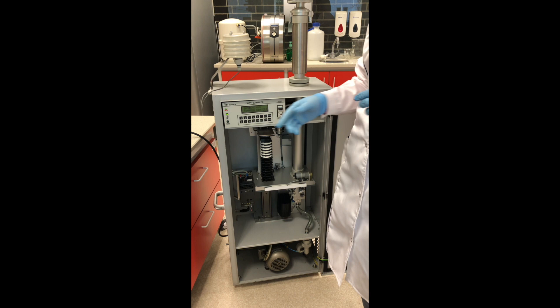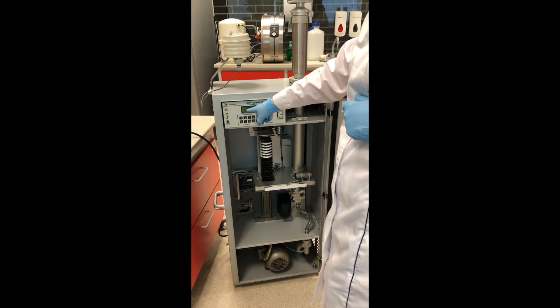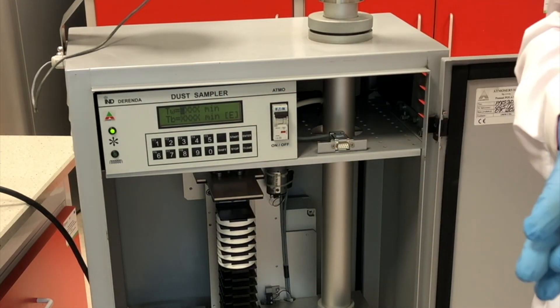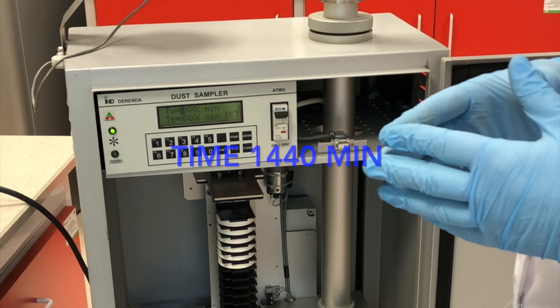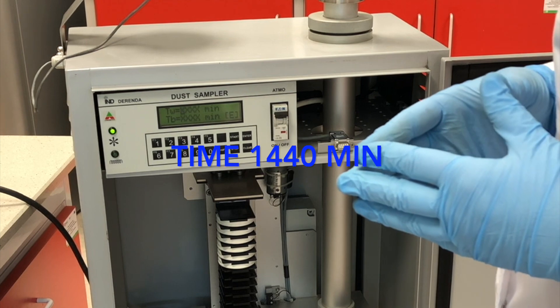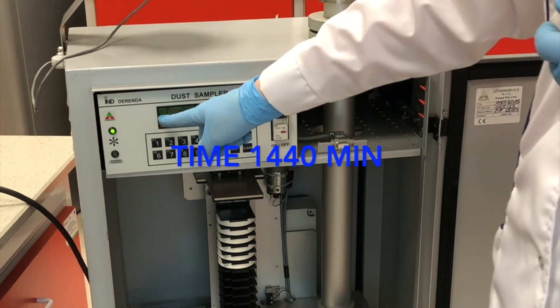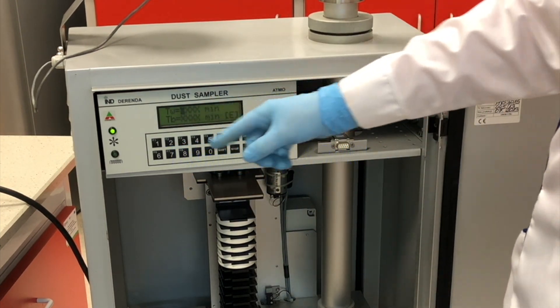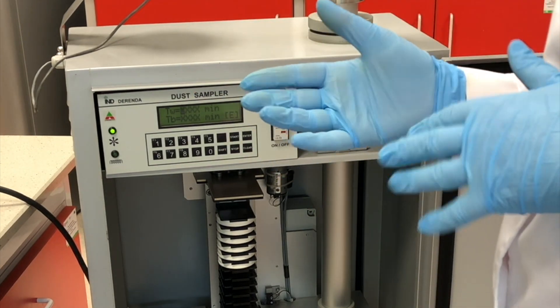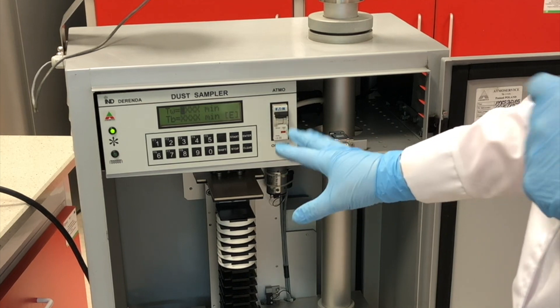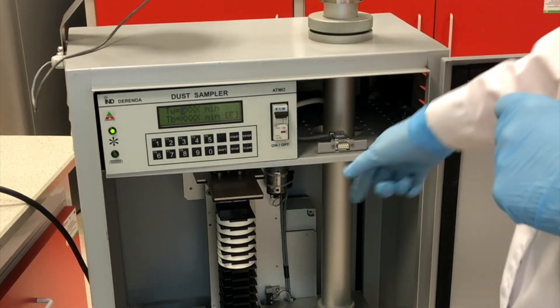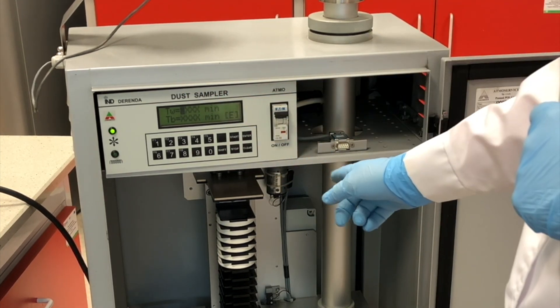Now, we determine the time of work. When we want the 24 hour measurements, we need 1440 minutes. And we also determine the time of break. Because there is at least 1 minute or 2 minute break when the sampler changes the filter.